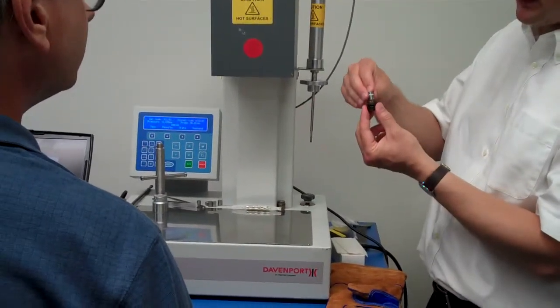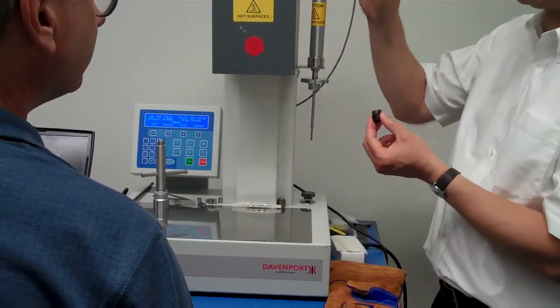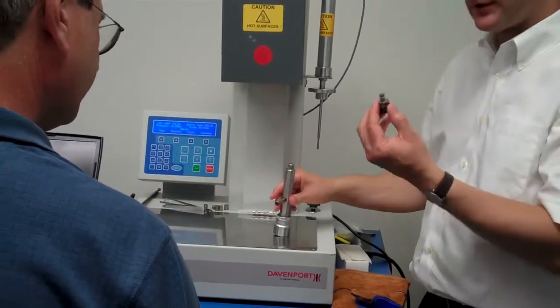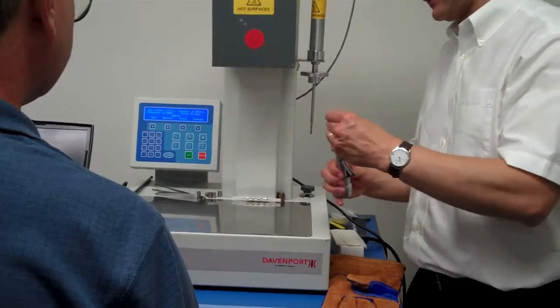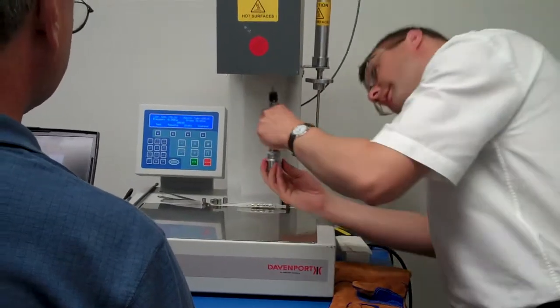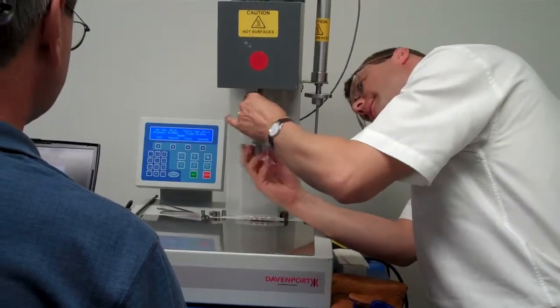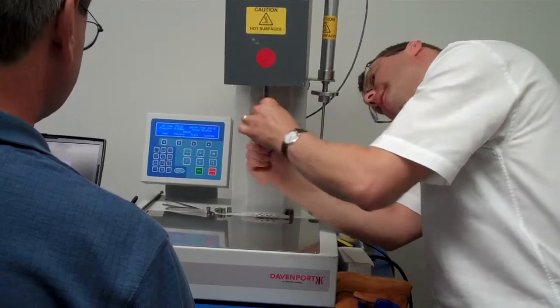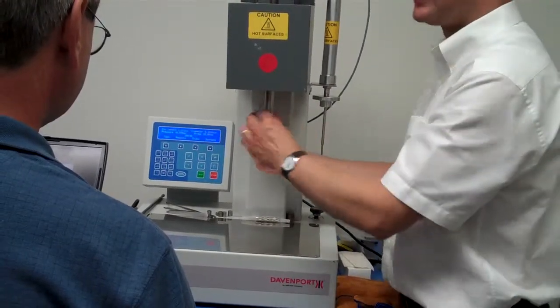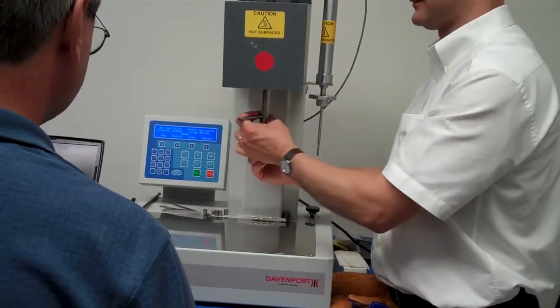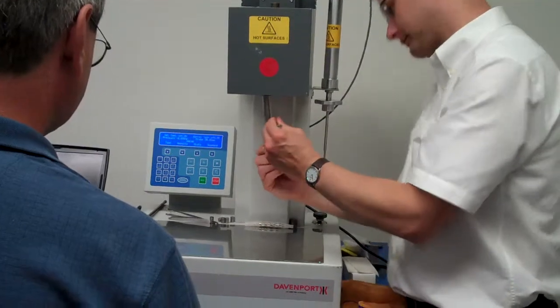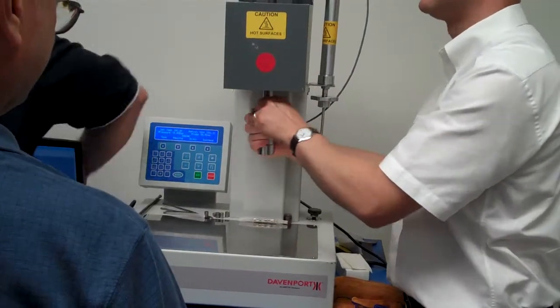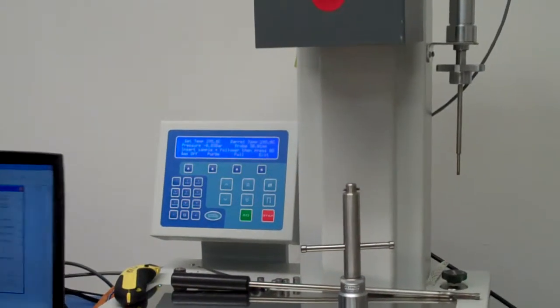The die goes in the holder with the seal towards the top and we use this tool, screw it in. We don't need to do this really tight, it just needs to be finger tight.